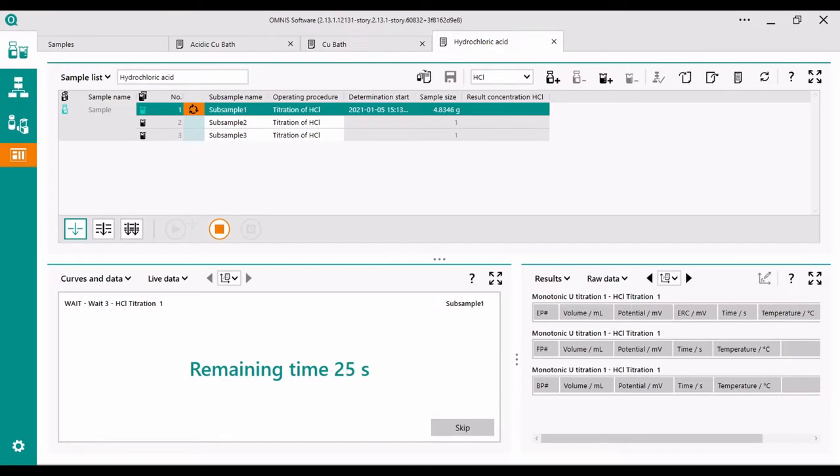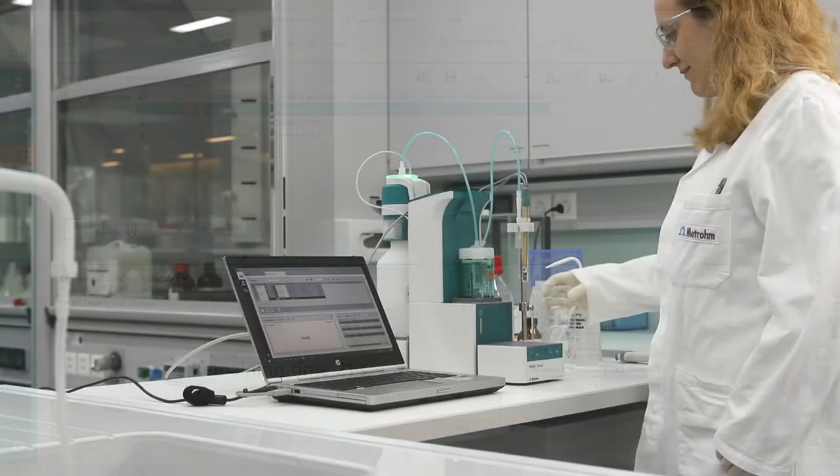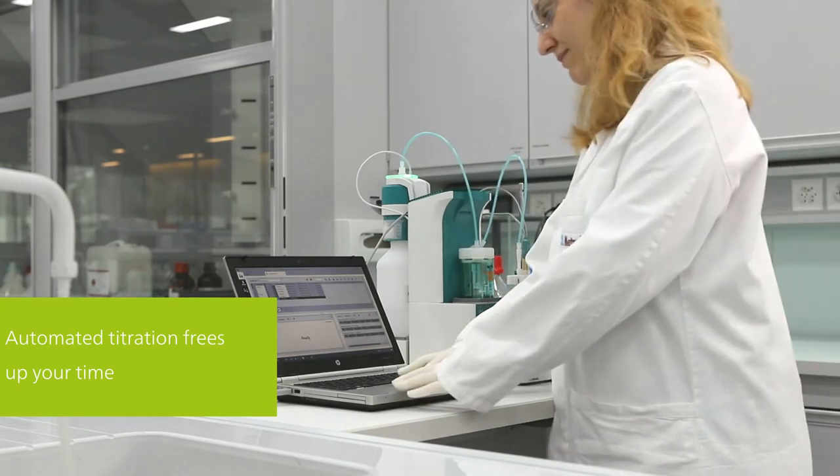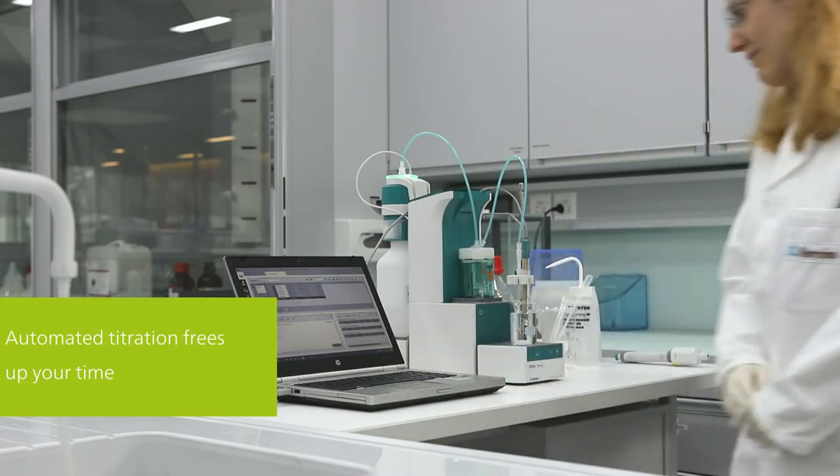You will no longer get wrong results because you missed a step in the SOP. And once the titration is started, you are free to do something else while the titration is performed automatically.